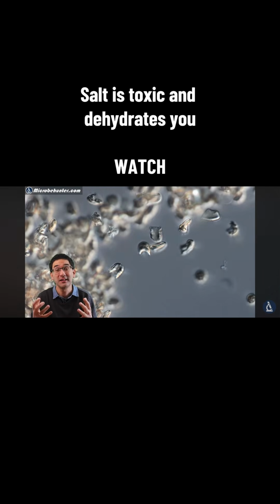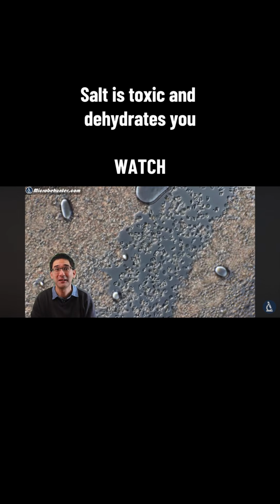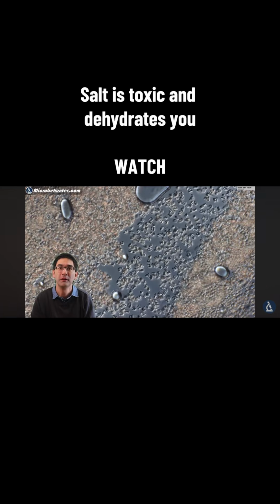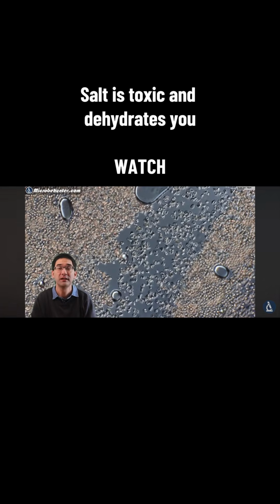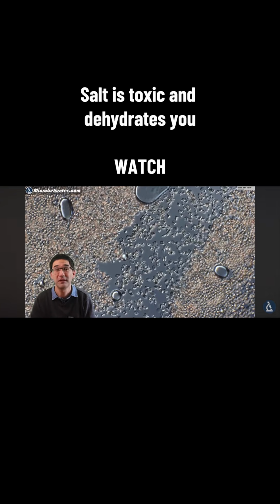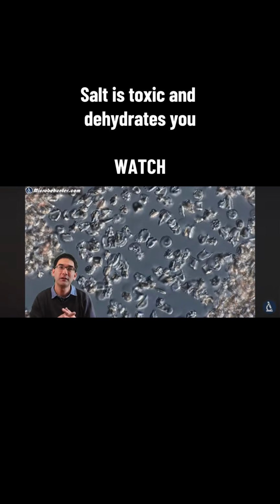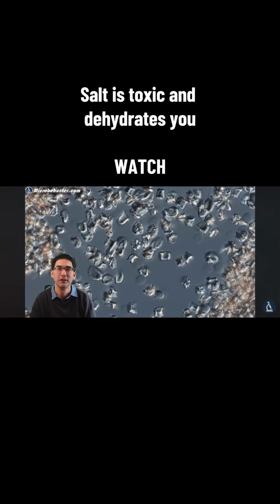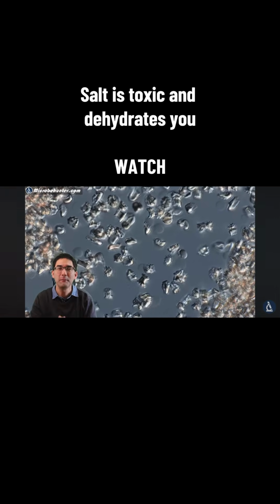But luckily, of course, I think that this is not really a very realistic scenario, because normally we do not get so much salt into our blood, but normally this is also something that essentially now shows why drinking salt water is not the best thing to do. Yeah, and here again you see a little bit of streaming of the red blood cells, very irregular right now, and a little bit misshapen.